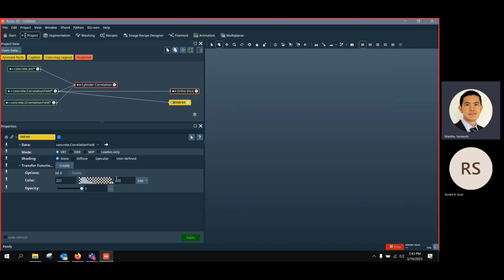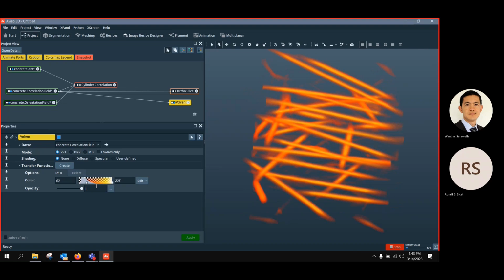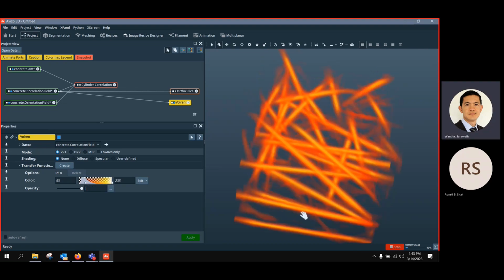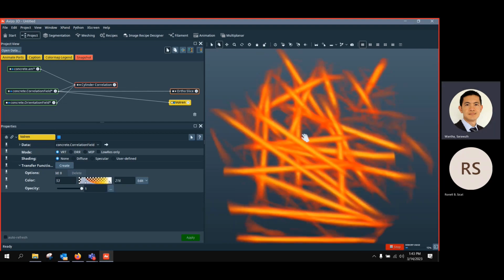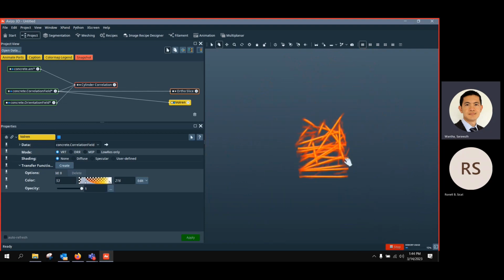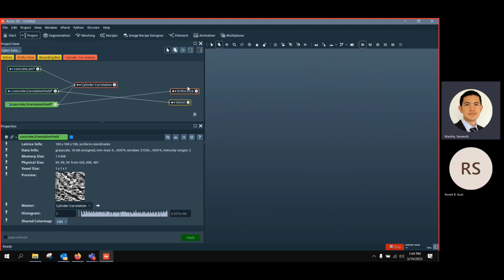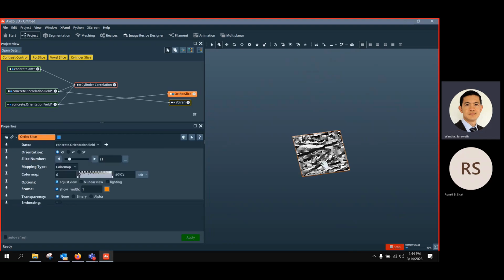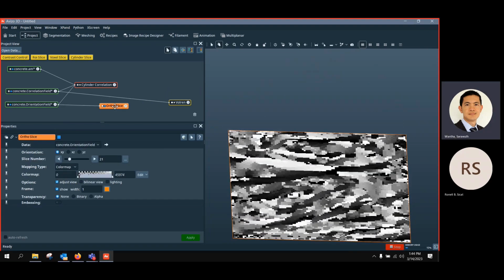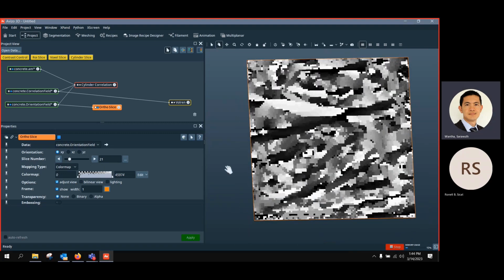By looking at the correlation volume like this, as you can see, most of the main fibers are in the high correlation, and the dim intensity is just not well correlated in terms of correlation score. But for the second result, the orientation field, it's impossible for us to interpret by eye. It's just computed information to give the orientation of the fiber. It really doesn't show you exactly what's there, but we need it.